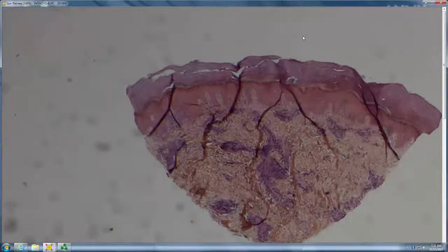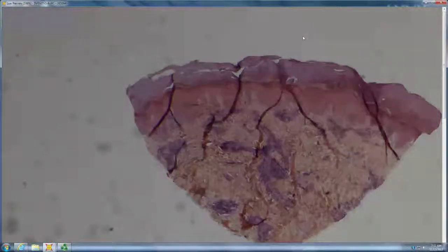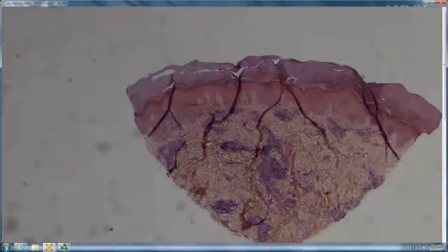Okay. So, Caleb, here just in time. So, what do you see? And you need to come to the scope, because that's not changing up there. You'll be looking at the same image the entire conference if you stay where you are.